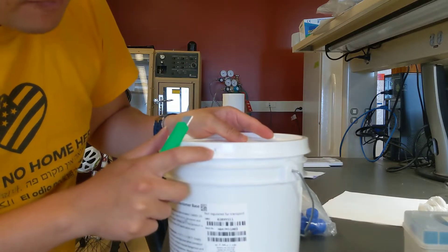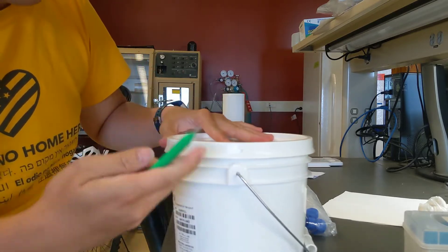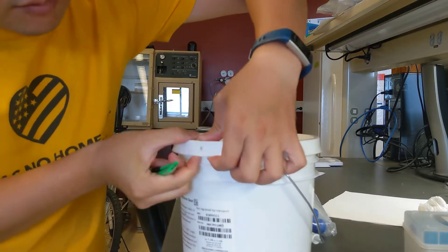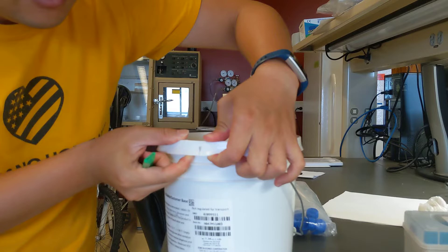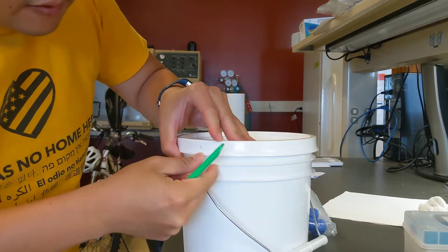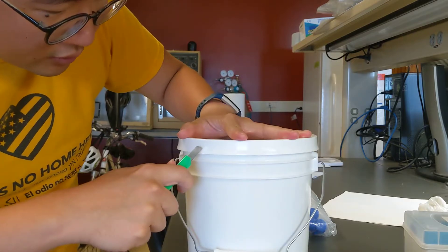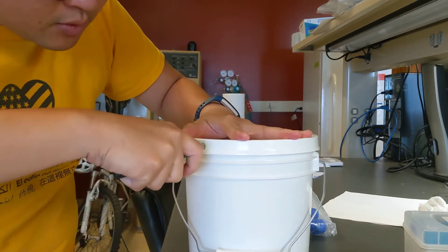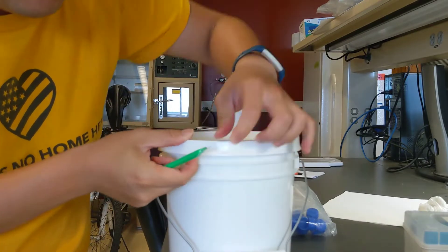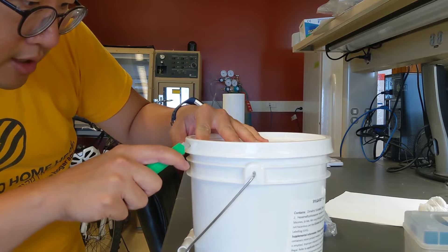First, you will see some holes on the cap of this container. You want to use your box cutter to cut it out to create a defect. Try to find all the holes on the jar — some will be obvious and some not so obvious. Basically, you just continue to make those cuts through the entire cap.